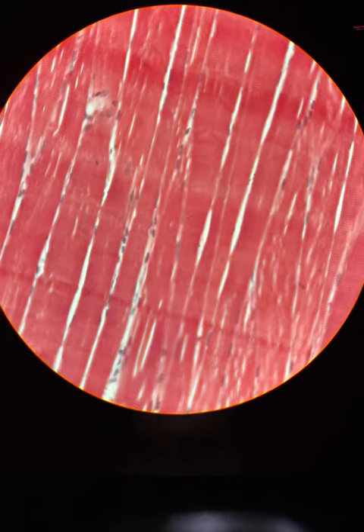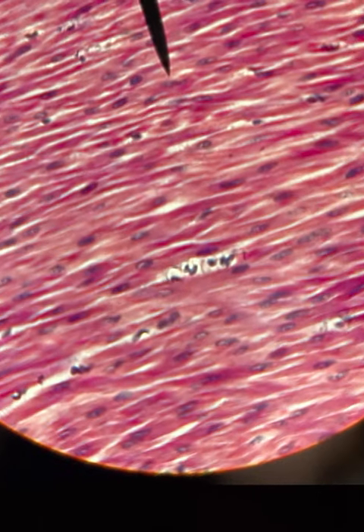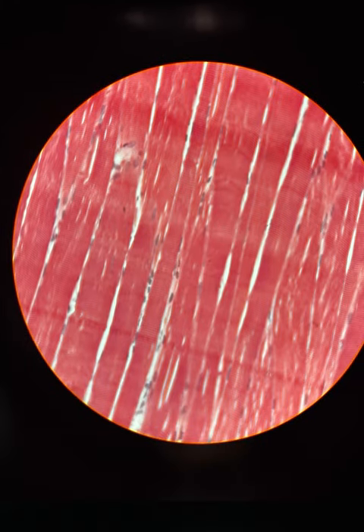All right, here's another muscle tissue that we have. This is skeletal muscle. And this has the striations. They're like these long, you see those striations? It also has these nuclei on the periphery. So skeletal muscle has peripheral nuclei as well as these striations. So that, remember, up here in our smooth muscle, see, no striations, which is why they call it smooth. And our skeletal muscle is the only voluntary muscle in our body. And this is what allows us to have voluntary movement of our skeleton. And it is found connected to bone, which allows us to move it. So when you work out, this is the muscle that is actually sore.